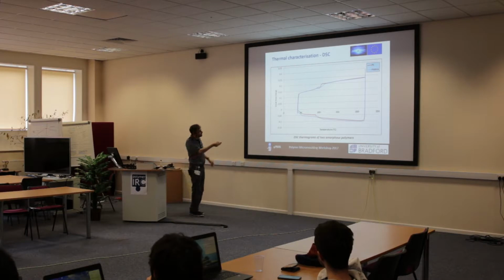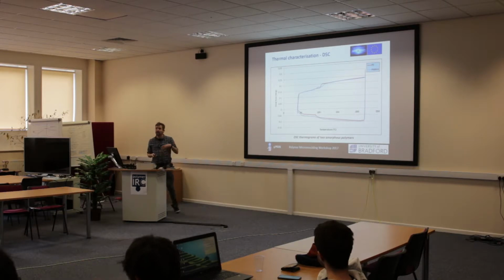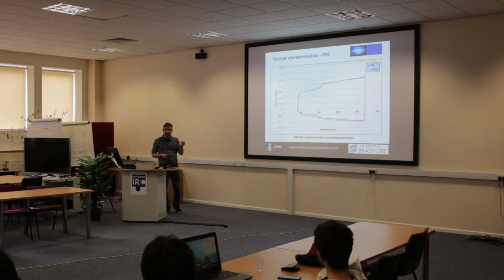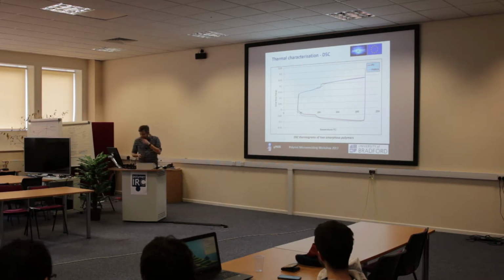Now the DSC, this is done on our older DSC, which can only go from ambient temperatures up. The one that you'll be using today will go down to minus 90 degrees C, and if you attach liquid nitrogen, you can get down to about minus 150 or so. So we can start to look at the glass transition temperatures of these materials, and you can shift that up and down using subtle chemistries and a variety of compounds.